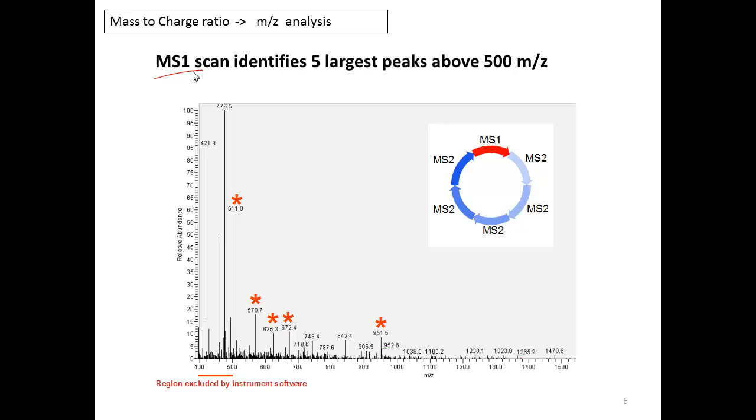intact peptides. So that very slow liquid chromatography column is eluting peptides at 5 nanoliters per minute, and at one instant here is a spectrum of all the m over z's, all the mass charged particles that are coming off that column at that instant. This data acquisition might take around 100 milliseconds, so it's a very short snapshot.